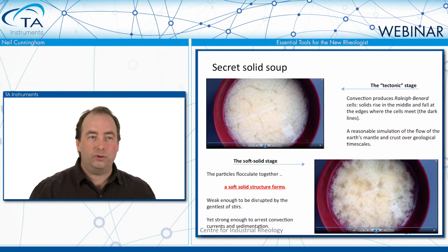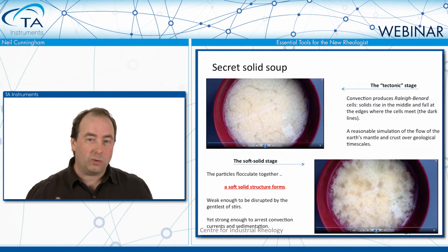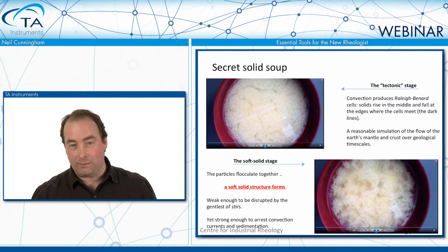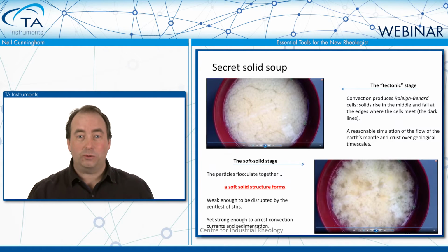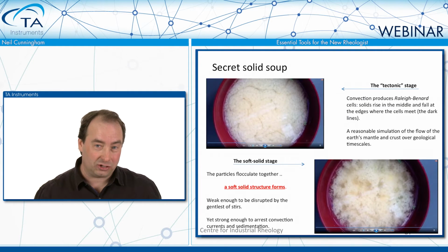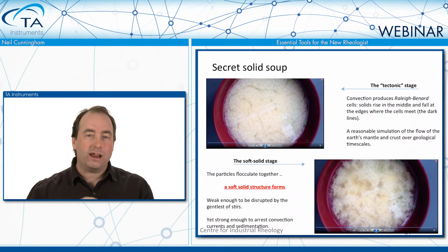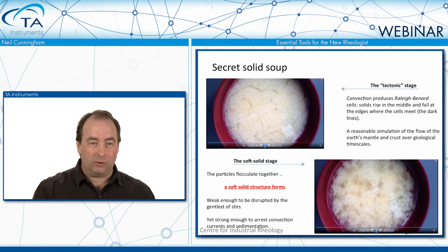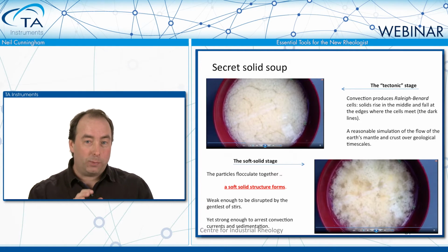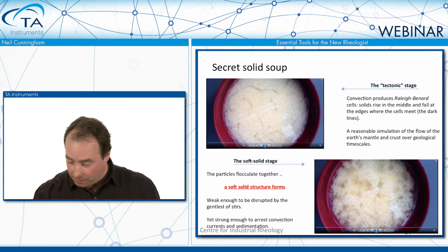Now just bear in mind that if you were to measure this with a viscometer, the viscometer is just going to drive its way through that structure and will disrupt that structure before it even starts taking a measurement. So really, viscometers look pretty delicate, but in rheological terms, they're a bit like taking a sledgehammer to the structure. And so that ability that I talked about earlier, the ability to be incredibly delicate with a material, that ability that you get with a research rheometer, and also the ability to push and let go and push and let go with an oscillatory testing mode, is a very powerful tool there.